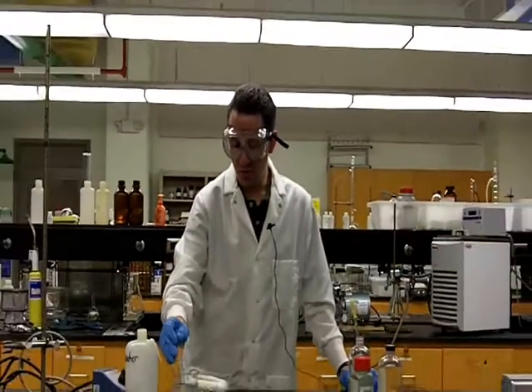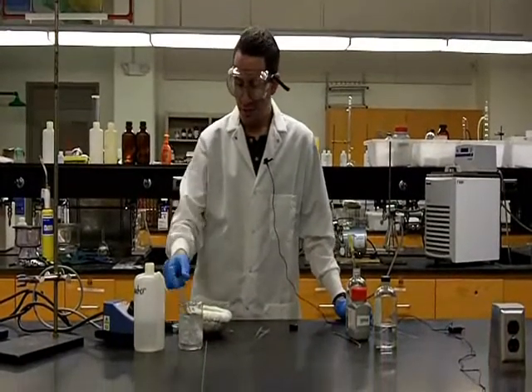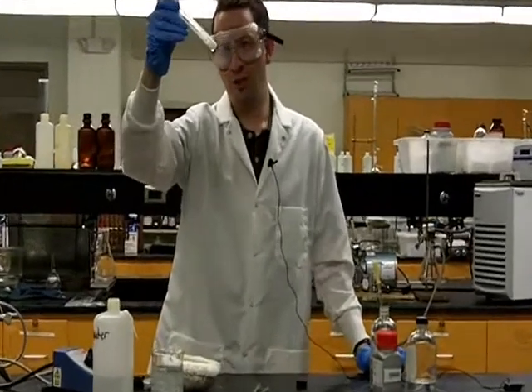Now that we're at room temperature, we can place it in an ice bath and see if we get further crystallization. Remember, you do not want to place your hot solution and hot glassware directly into the ice bath, because you may get poor crystallization as well as break the glassware.